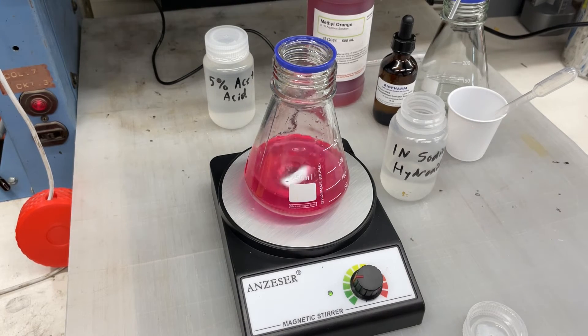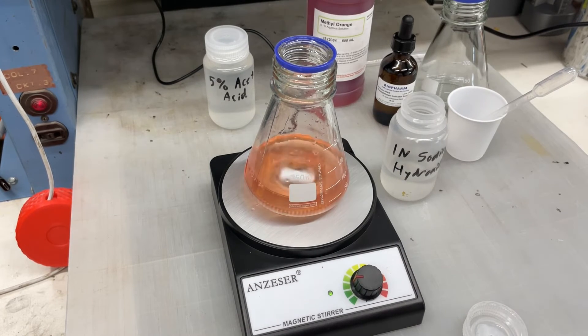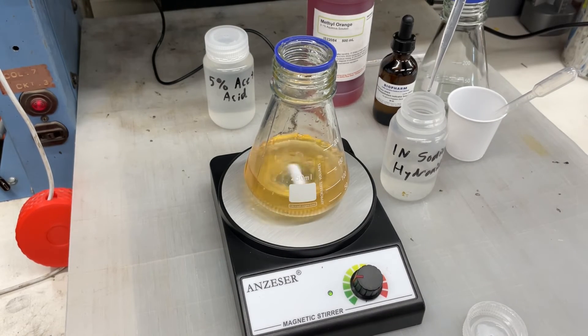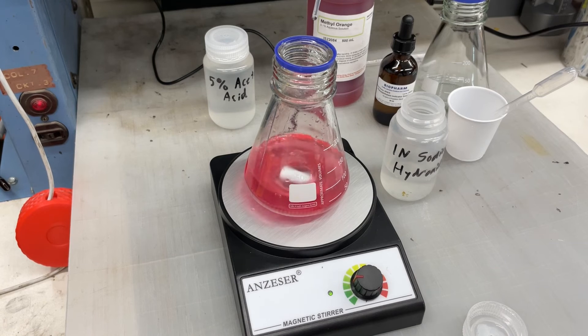You use however many mils of sodium hydroxide solution it took after the first step, take that number and multiply it by 1.8, and that is how many grams per liter of dissolved aluminum is in your solution. For my tank this time it was 3, which works out to 5.4 grams per liter of aluminum.